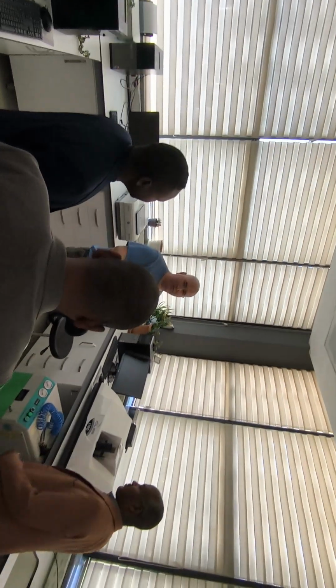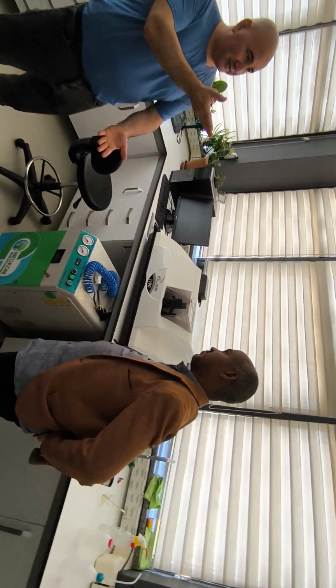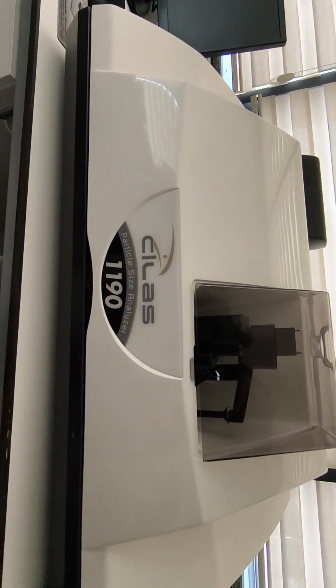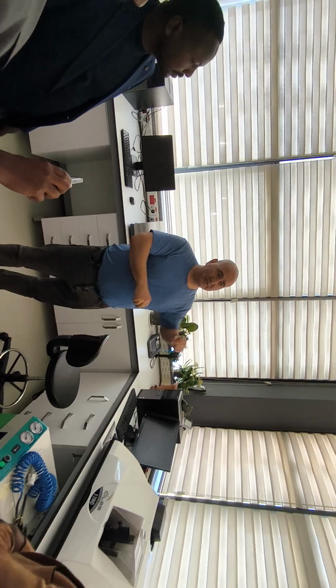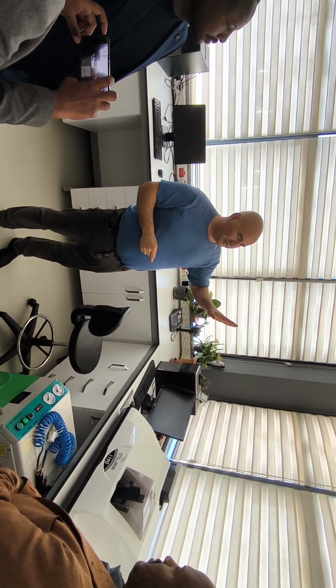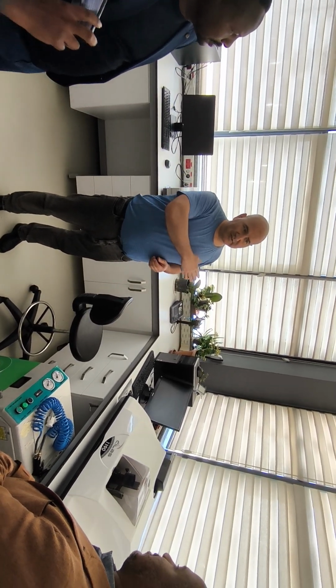Here is for particle size. So for example, if you have your molecules, you have the sieving way with the sieves. But this one is more precise. You can see from a few nanometers or microns up to a few millimeters, and it tells what the rate is and so on. In a few minutes, we can see the particle size distribution.